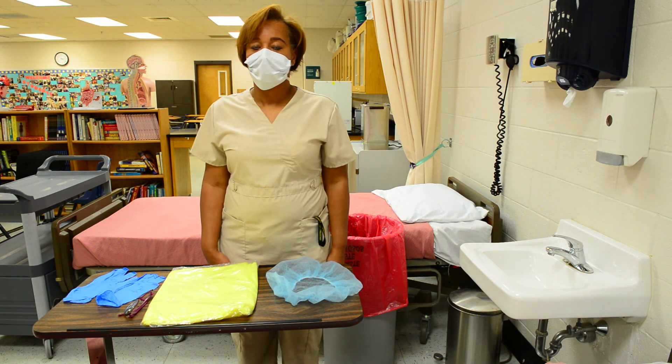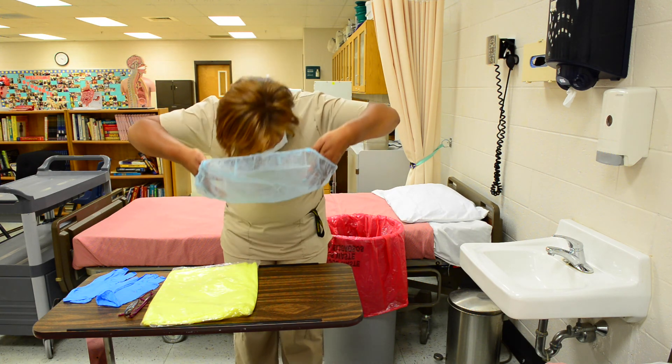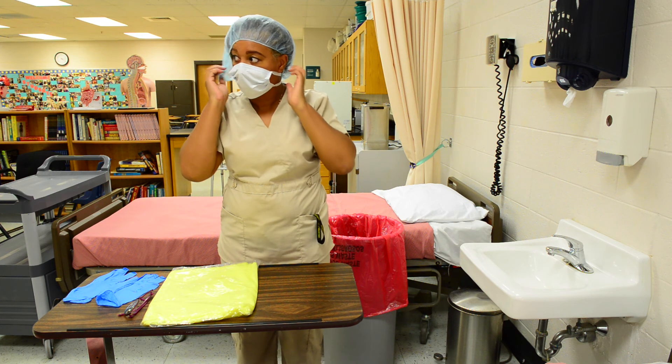After the mask, put the hair covering, making sure all hair is securely underneath the hair covering.